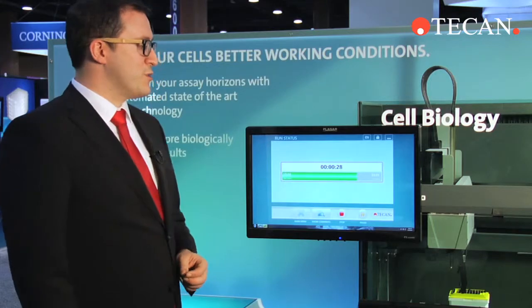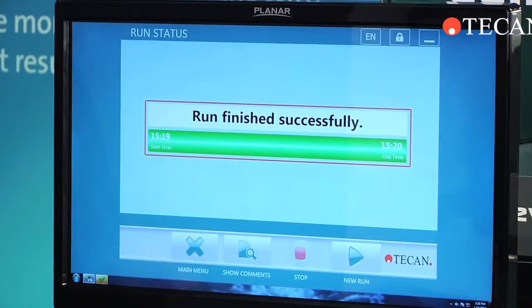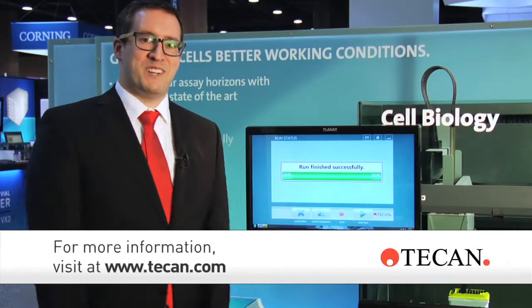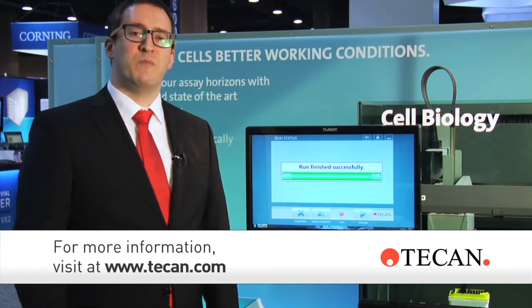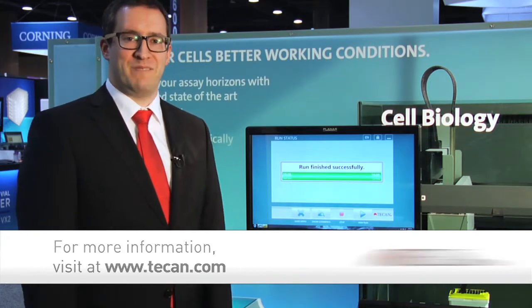And that's pretty much TouchTools 3.0. We can see here the run was finished successfully, and thank you for your attention today. For more information, check us out on tecan.com.